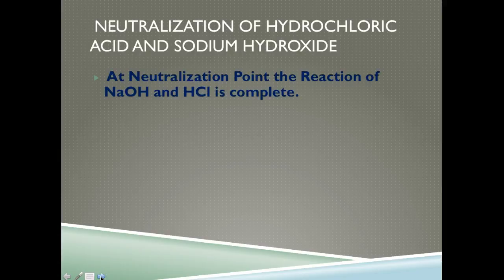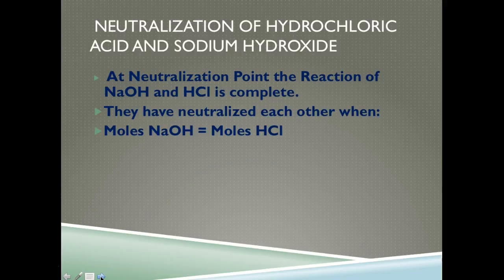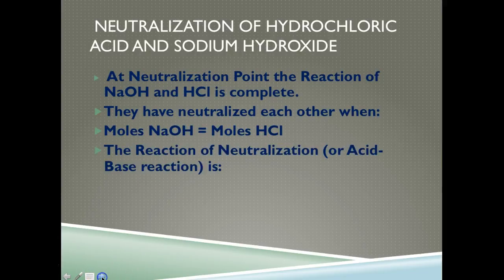So at the neutralization point, I also have to point out that in this experiment, we are not monitoring pH, okay? We are simply noting down the volumes. So at the neutralization point, the reaction of NaOH and HCl is complete. They have neutralized each other, where moles of NaOH is equal to the moles of HCl, okay?